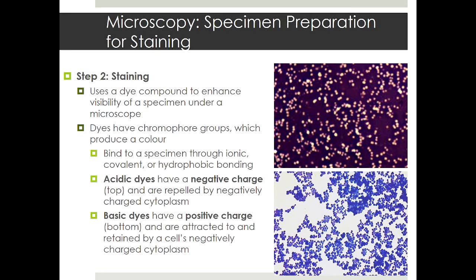With bacteria, typically using a negative stain or a simple stain will give you kind of the same result. You're still going to see the basic shape and arrangement of cells. The only difference is when you use a negative stain, which has a negative charge, and you get that repulsion from the cells like this, these preps don't need to be heat fixed. So thinking about what we just talked about, not needing to heat fix cells allows you to see them better in their native state.